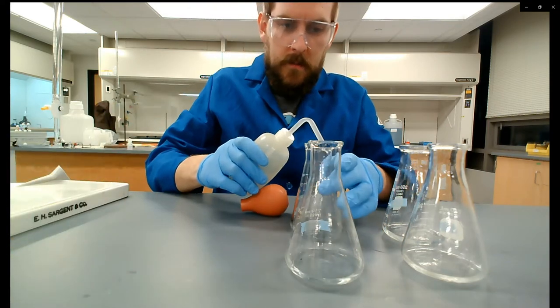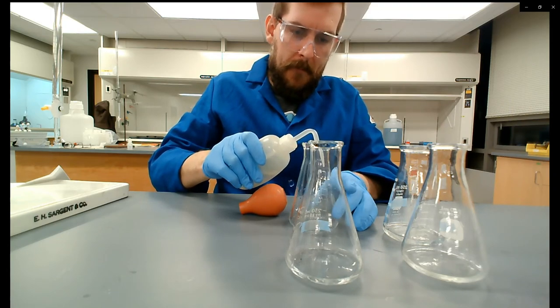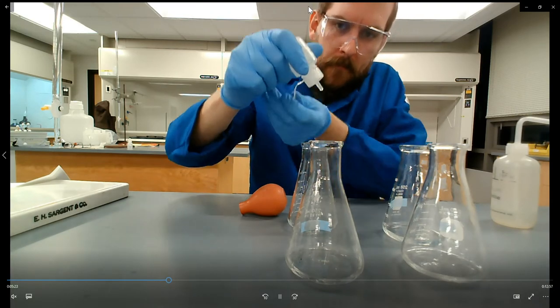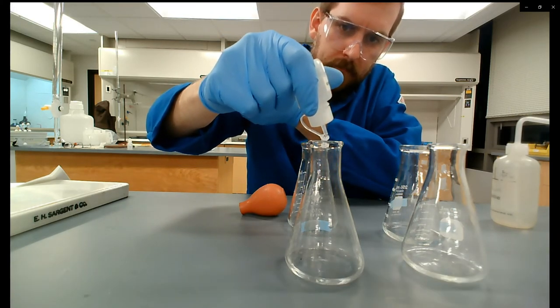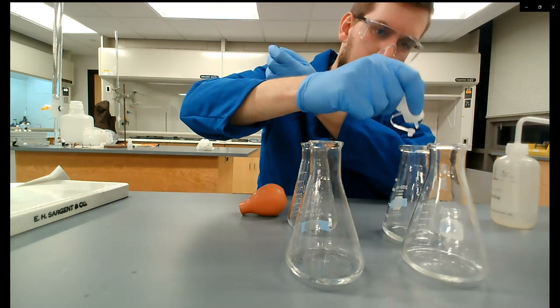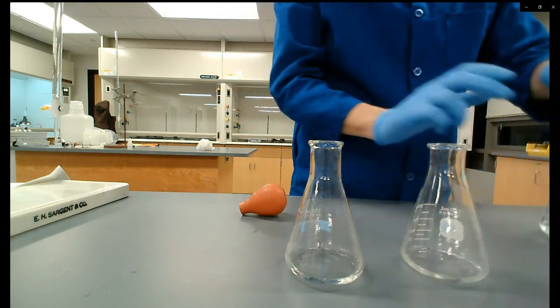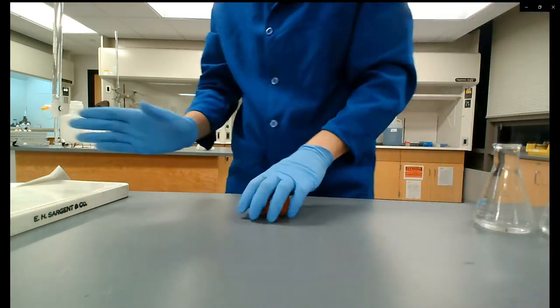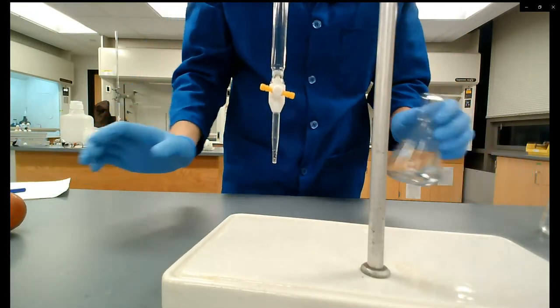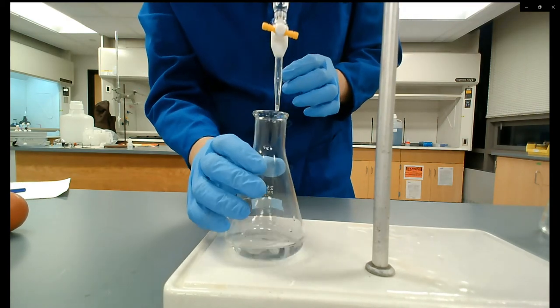I'm adding two to three drops of phenolphthalein indicator to each flask — the same indicator as the previous set of titrations, same color change. It's acetic acid right now so the pH is low and phenolphthalein looks colorless. We're adding sodium hydroxide, so I'm looking for that faint pink endpoint again. I've already recorded the initial burette reading.